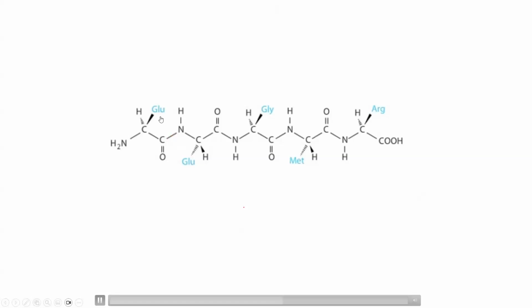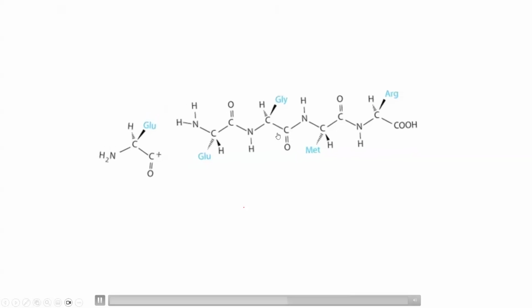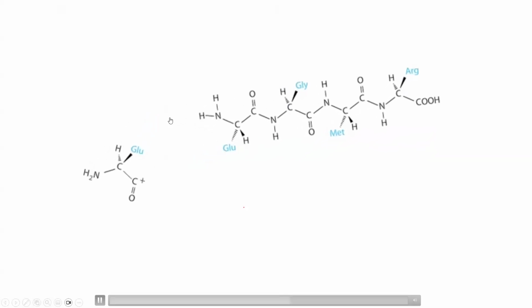You see, because of fragmentation you can have different kinds of broken bonds, right?